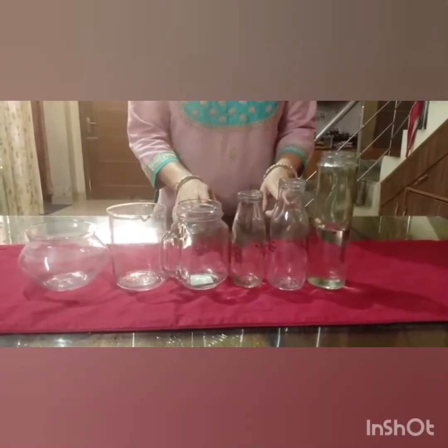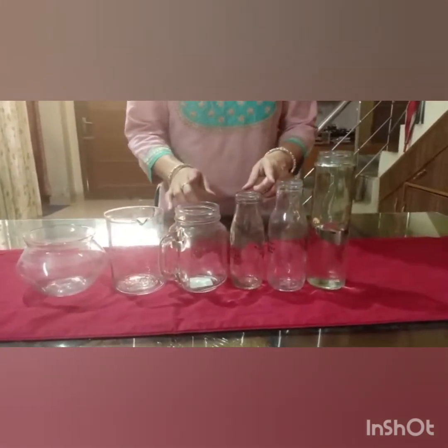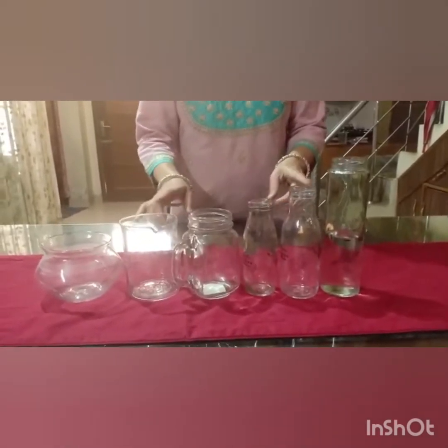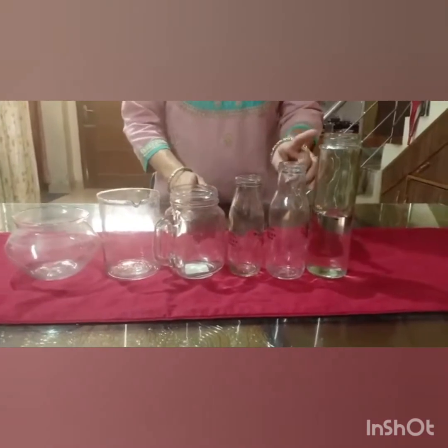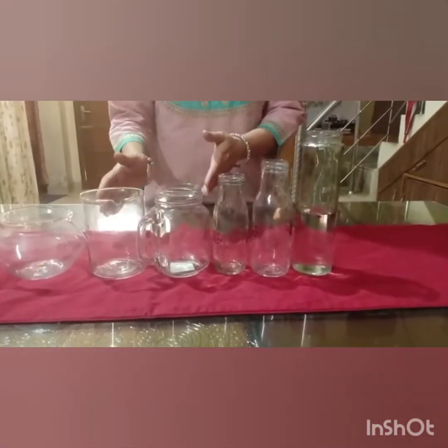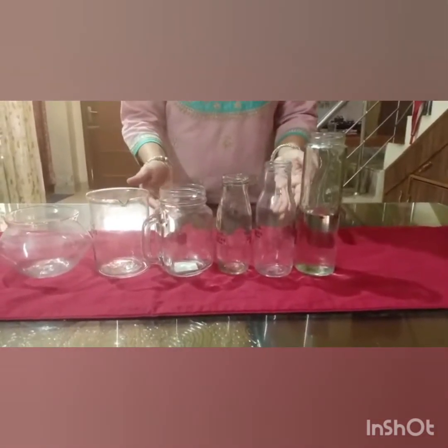The aim of the experiment is that liquids have definite volume but indefinite shape, right? So what do I need for this? I need a measuring cylinder and different types of flasks or containers, right? Now how do I proceed with the experiment?